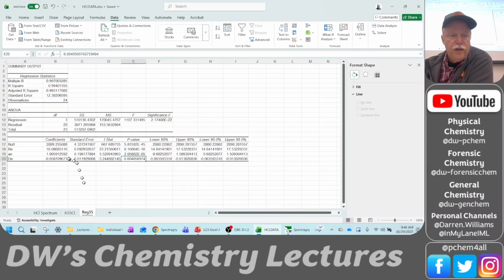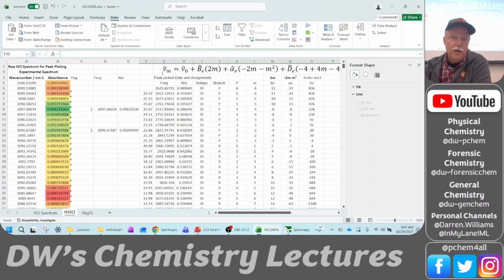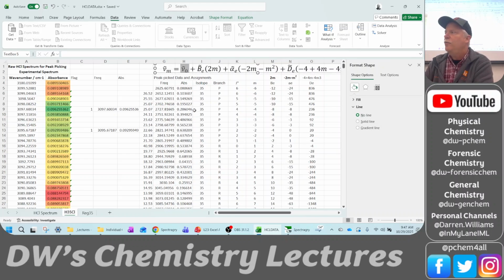Yeah, because when you leave labels on, it put these three right there, instead of saying x variable 1. If you don't have the labels, it'll just call it x variable 1, x variable 2, x variable 3, and those are your three columns. And the intercept would be, from your equation, this value right here. That's the intercept, right? It has no m value beside it. So your intercept is this one. This would be x variable 1 because that's column 1, and so on.